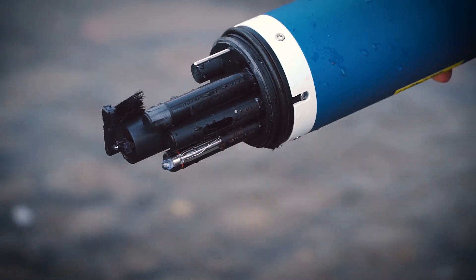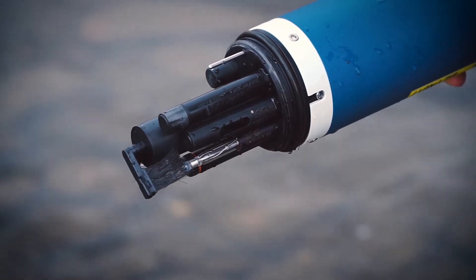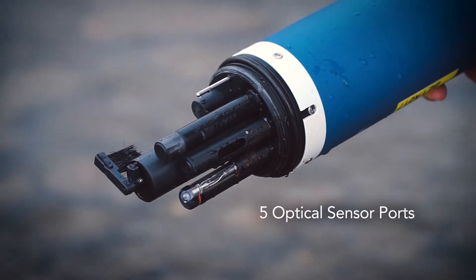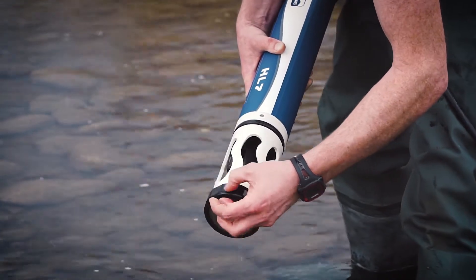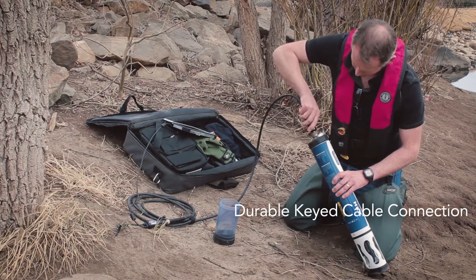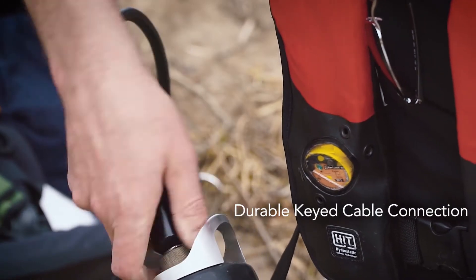Significantly extend field use with proven sensor technology combined with the central anti-fouling cleaning brush. Five optical sensor ports expand the number of parameters. Durable sensors help maintain a cost-effective water quality monitor.